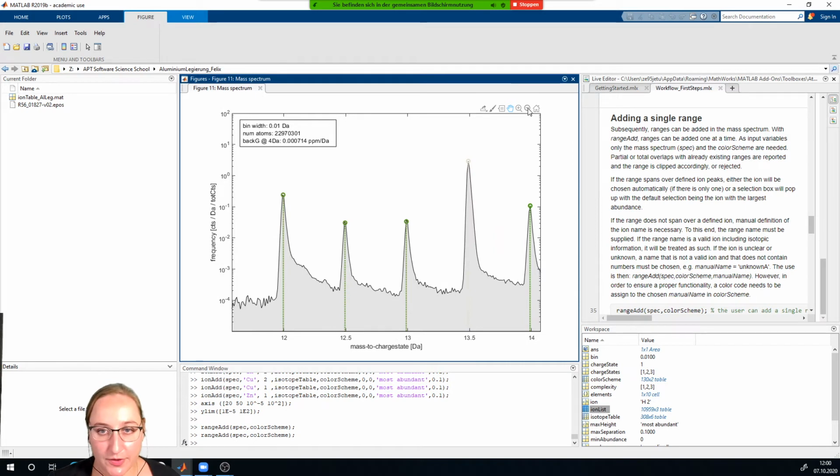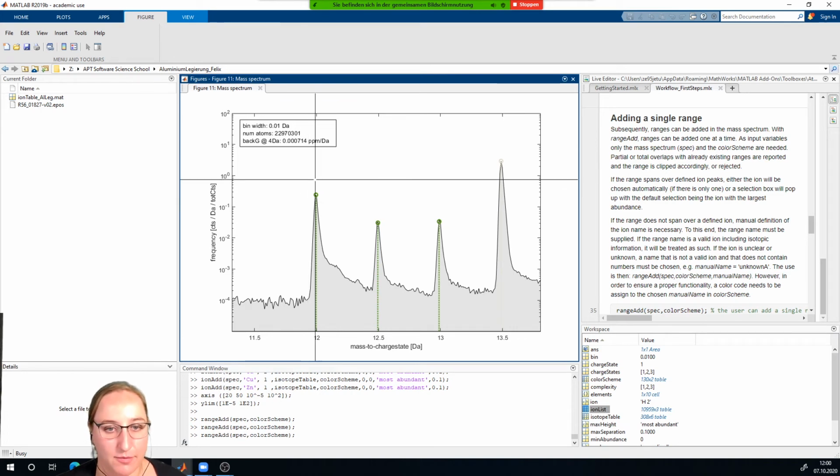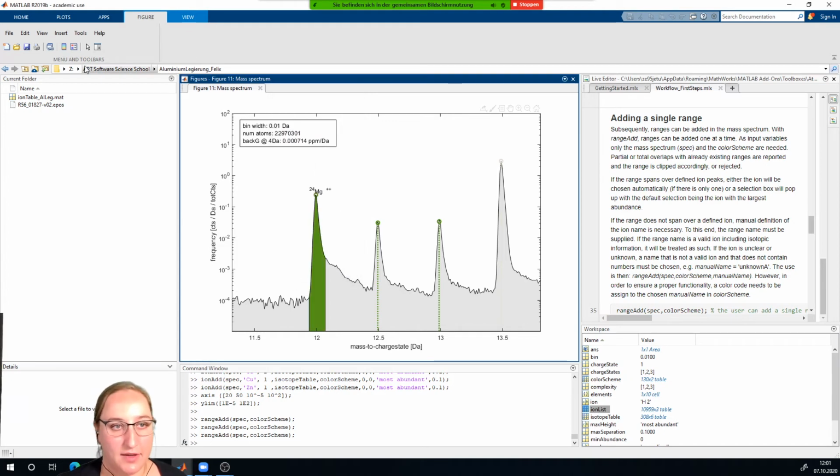That's all. We can continue a little bit also. Does that work with everybody? Oh, in this case, you can see I've added magnesium two times because it tells me two times the same one. So I hit OK. And then I go on the select button and select the ions one time and delete it. So now it's just there one time. Okay.